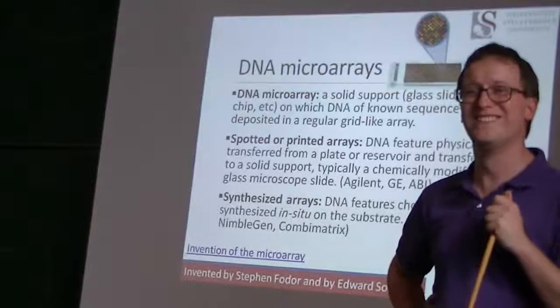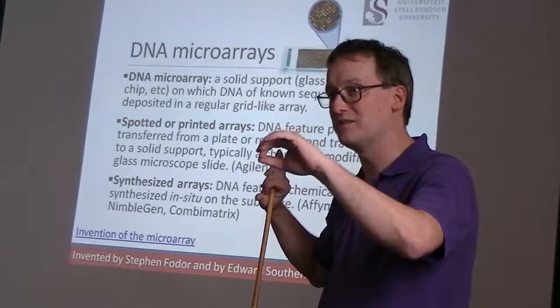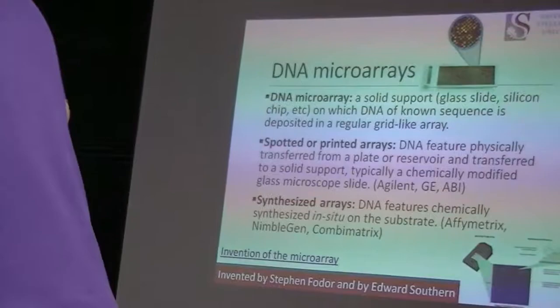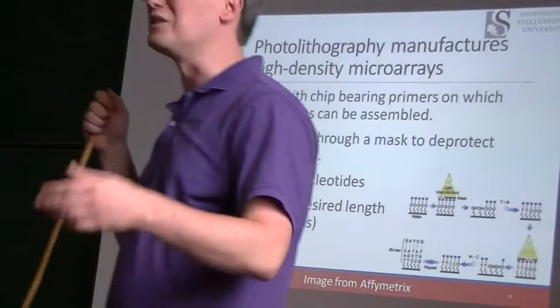Well, in situ means in the place itself. So we synthesize the DNA strands on the microarray itself. We grow DNA right off the plate. It's a really magical little trick, and we're going to talk about how that works. There's a link, by the way, on the invention of the microarray. It's actually kind of a fascinating little tale, so I wouldn't want you to miss that. Not on the quiz, but it's still interesting.